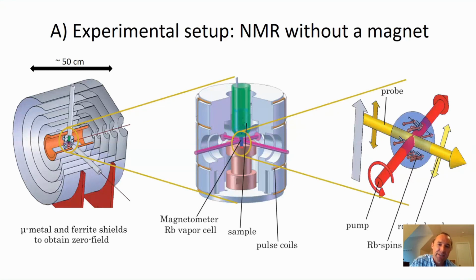To summarize once more, there are small magnetic fields that come from the NMR tube, this NMR tube sits on top of the sensor, and in the sensor there's a mechanism that can measure these magnetic fields. So let's think about the details of how these rubidium spins can actually measure a magnetic field.